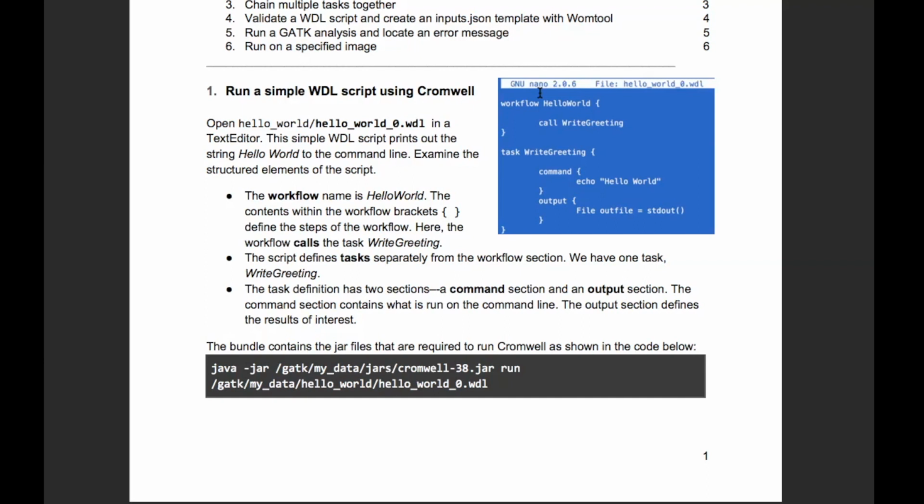What this is essentially telling you is that this is where your output file went. It gives you the name of the workflow, a unique workflow ID, the name of your call, your task, and then this word execution, which is common to all the output lists. And then this is the name of the file that your output went into.